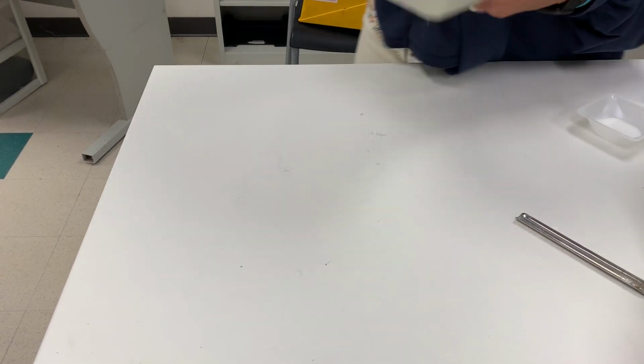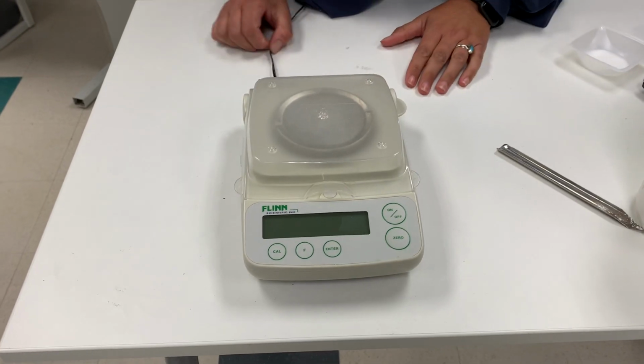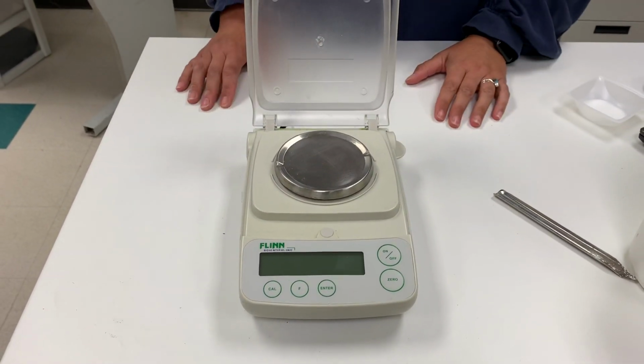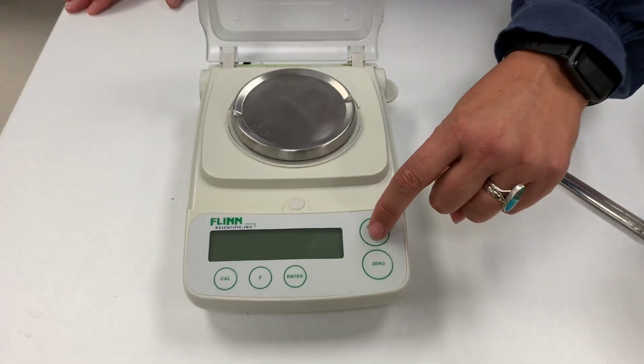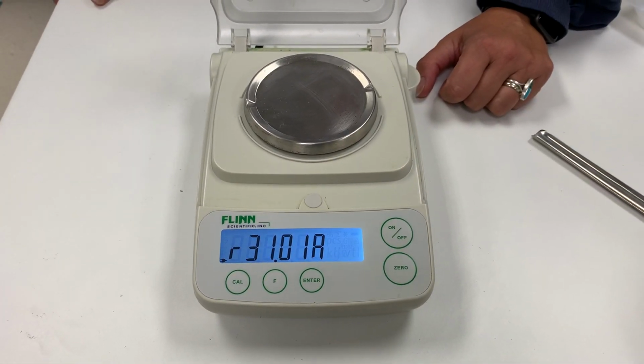Other things that I want to show you that you're going to use a lot of will include the digital balance. Things that are important to remember about the digital balance is that you first, before you turn it on, need to open the lid. Can't tell you how many times kids try to weigh something and the lid is not open. So the next thing you're going to do is turn it on and wait. Keep waiting. Still waiting.